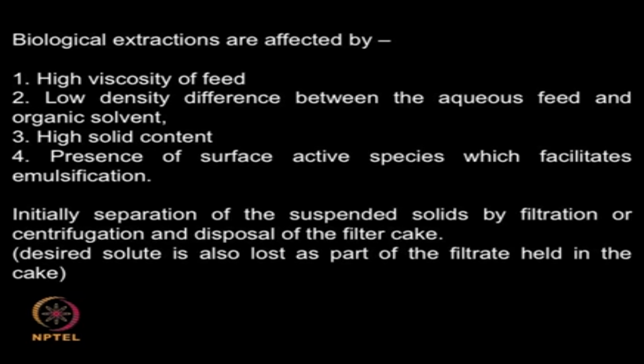So, the two liquids separate out nicely and we can remove the bottom and the top layers independently of each other. High solid content, as you know, fermentation broth contains a large number of salts which you add, so there is going to be a lot of solid present. The solids are going to hinder your extraction.